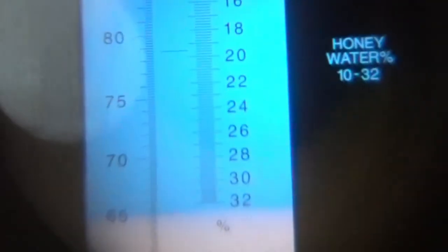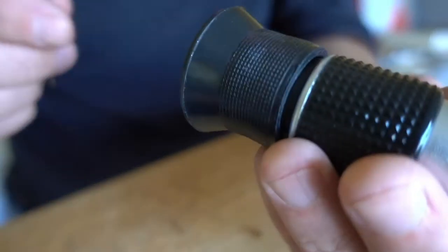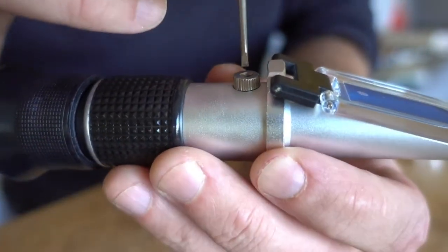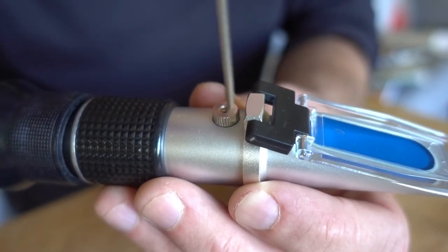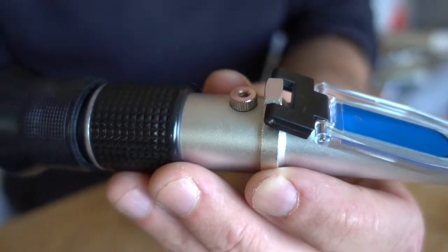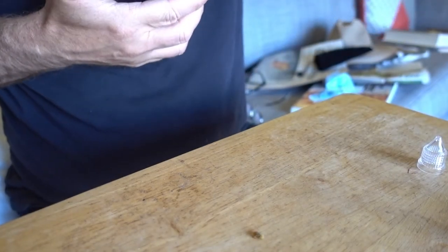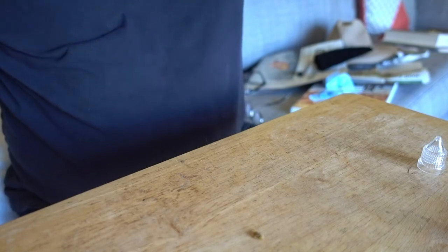Well that was really interesting. I don't know if you can see this, there it is, it's dead on, it's dead on 65 percent right now and while I was looking through it I moved this screw and I just turned it to the left until it went up to 65 percent and now it says 65 percent. Let's see if I can get a good picture of this.